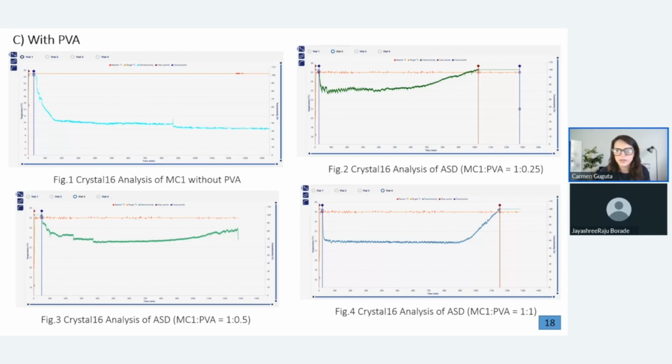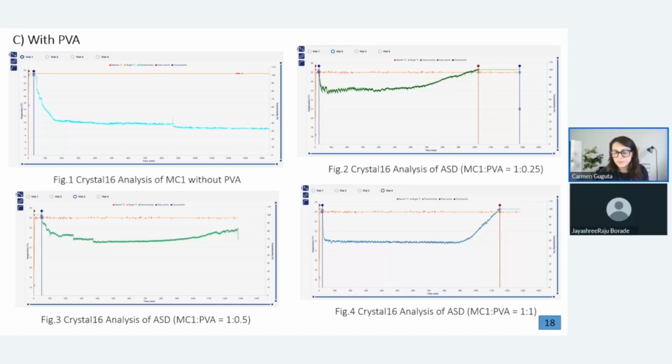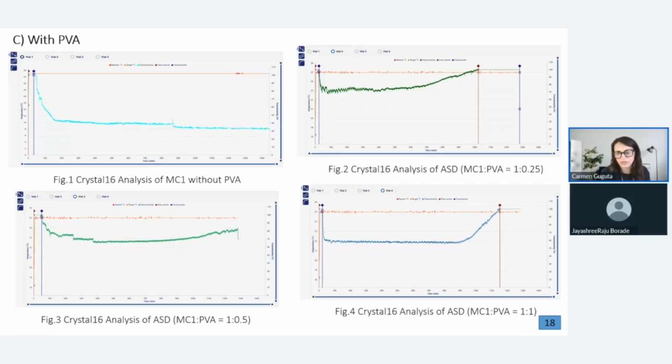And in the last 5 years, 10 years, I can even dare to say, there are a lot of publications out there where co-crystallization is tried with another drug. So you actually tackle two pain points at the same time. It helps quite a lot. There are articles out there. I don't know, Sharmita, if you hear me, what is your opinion about co-crystallization in general?